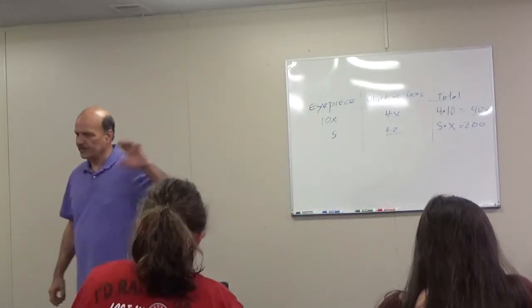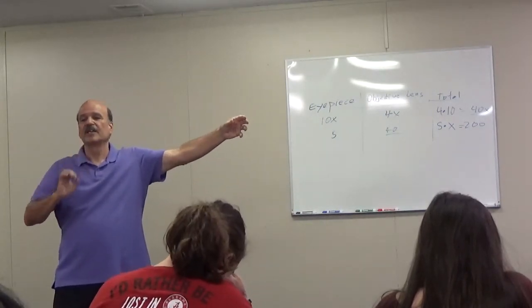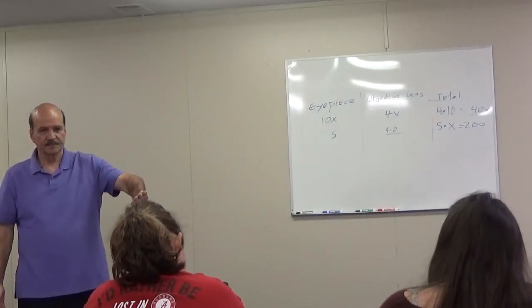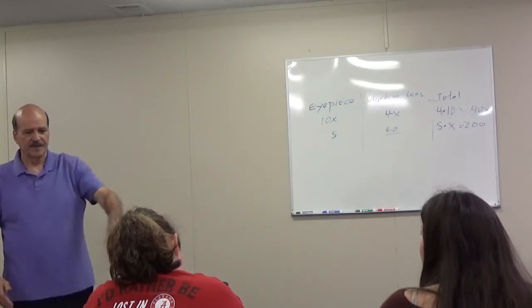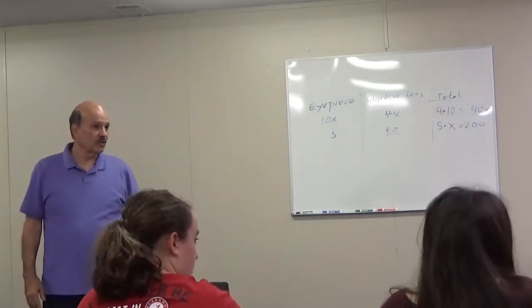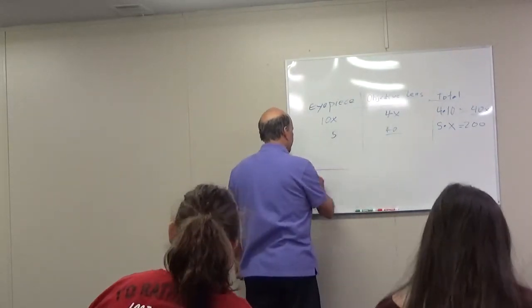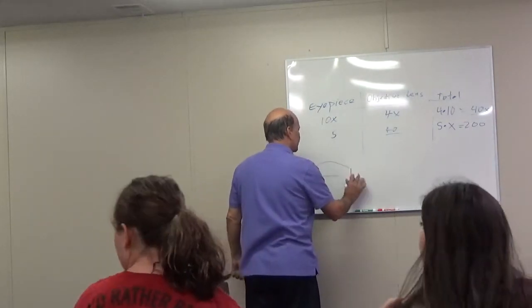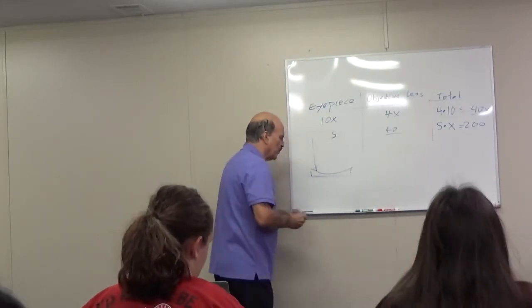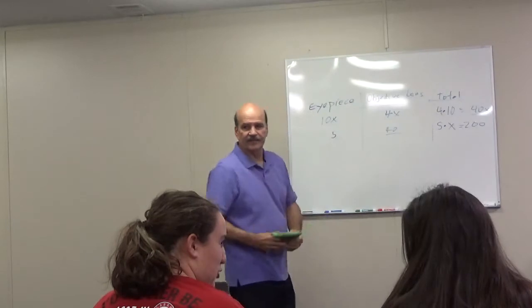You've got your eyepiece and your objective lens. The telescope works the same way: you've got your eyepiece and you've got the refractor objective lens. If you use mirrors, it reflects in and the mirror is concave and it magnifies based on the degree of concaveness. Convex would be like this, if this was your mirror. But in a telescope it's like this, so it's concave, and light comes in. It's not important, I'm just saying telescopes work the same way. They magnify based on the product of the eyepiece.